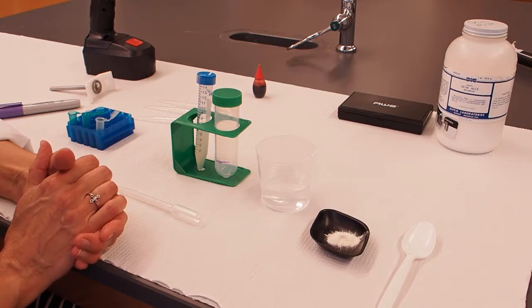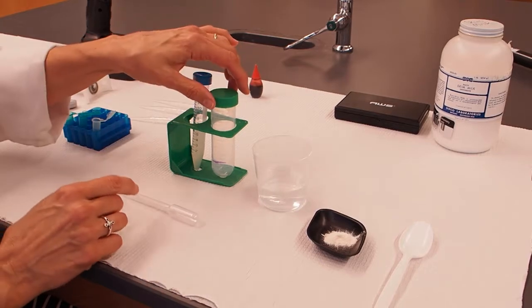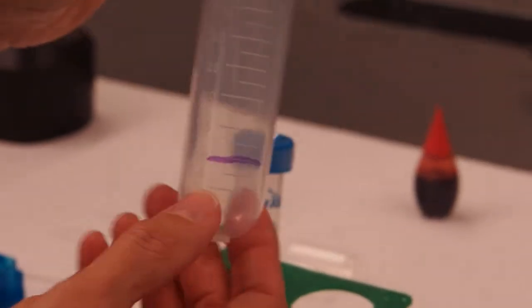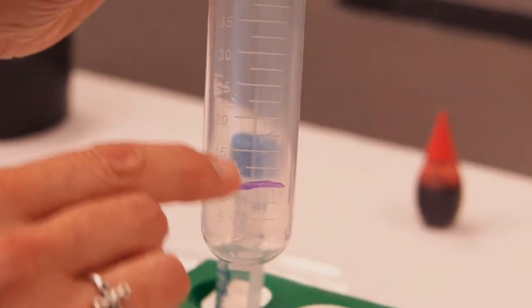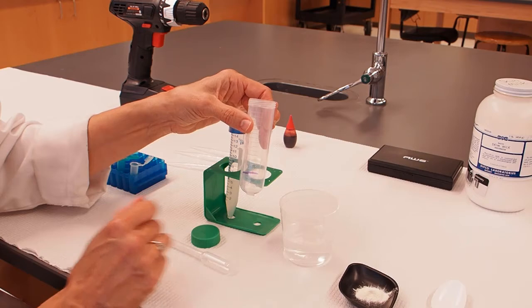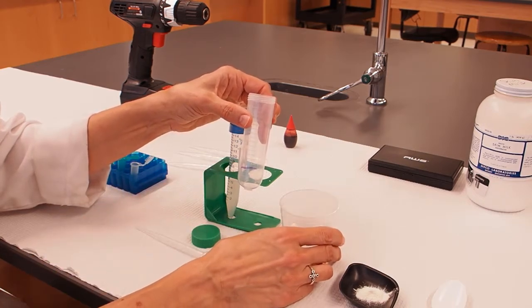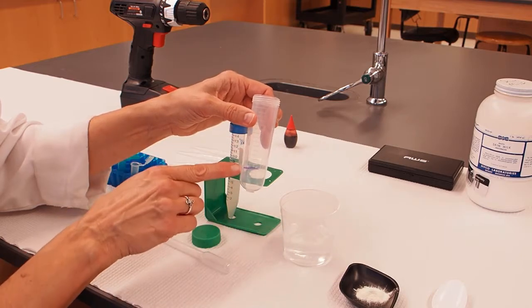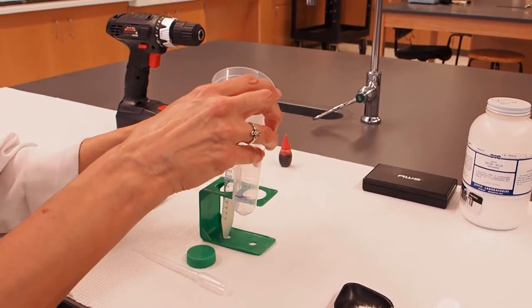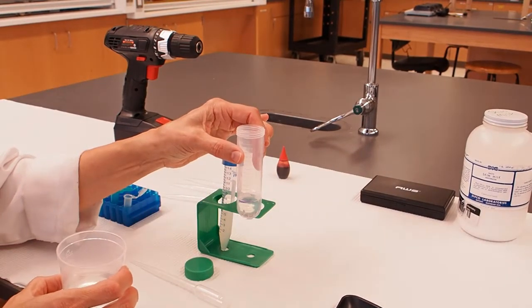The first thing we're going to do is add 10 milliliters of water to our large tube. I've marked this tube at the 10 milliliter line. You'll notice these test tubes have volume markings on them. So I'm going to add 10 milliliters of water to this tube and I've marked the 10 milliliter line so that you can see it. I'm going to pour water in to the 10 milliliter line.